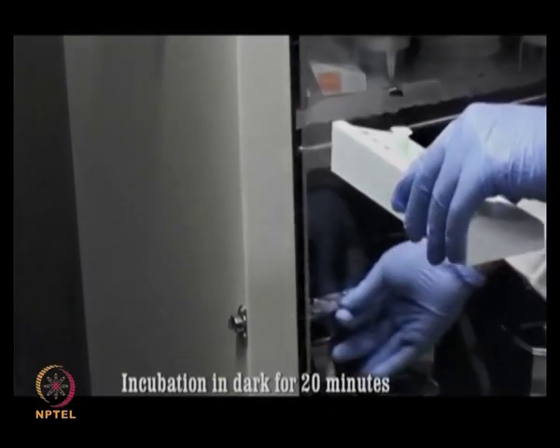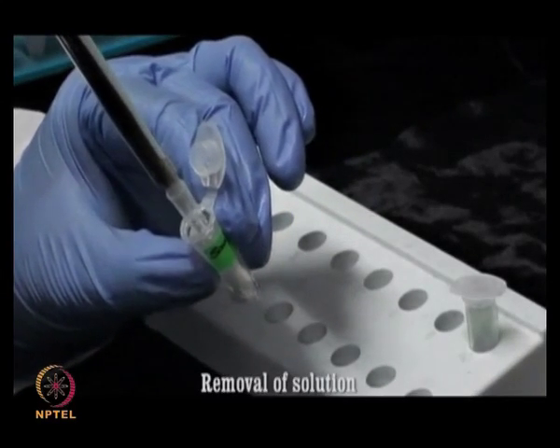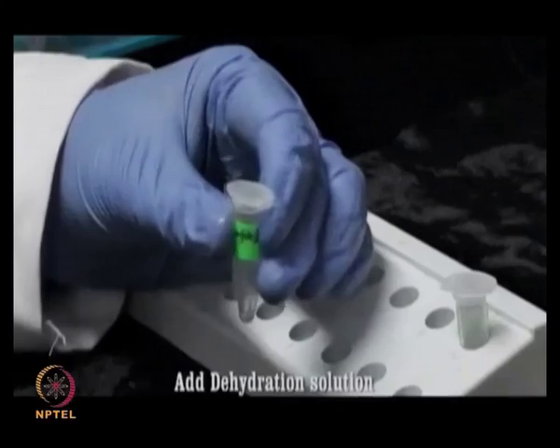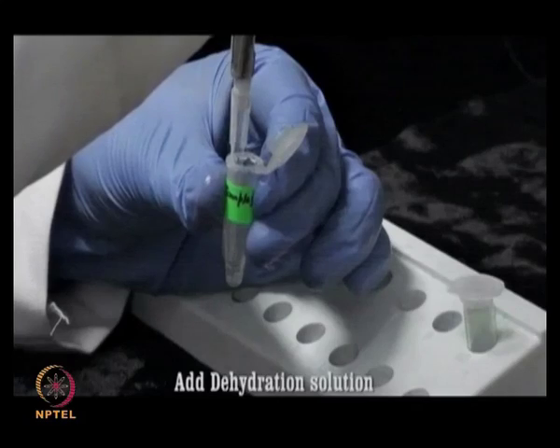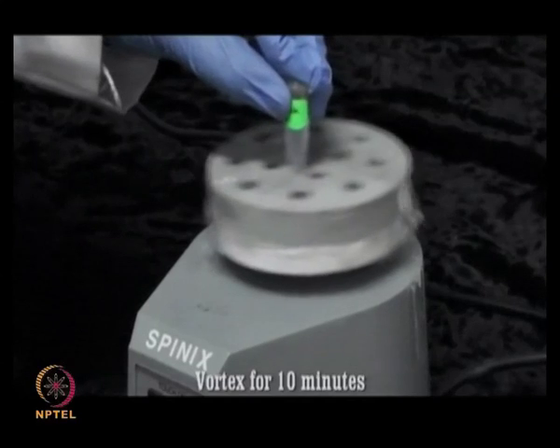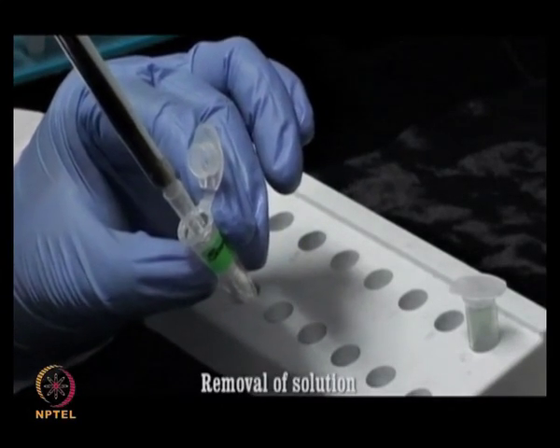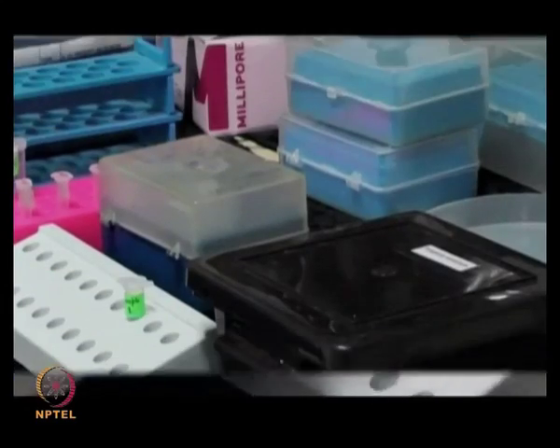Now, your incubation is over. So, you can remove the tubes and now remove the solution. Now, add 50 microliter of dehydration solution, mix it properly by vortexing and incubate it for 10 minutes. Again, you need to remove all the solution.